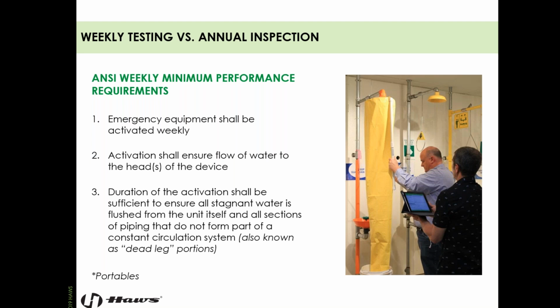I have seen every flavor of water come out of an eyewash or safety shower because it was ignored for too long. I've seen water that looked like Gatorade, rust coming out of it, one that was basically concentrated evil. It was like pitch black. So we need to make sure that we're clearing out the dead legs.